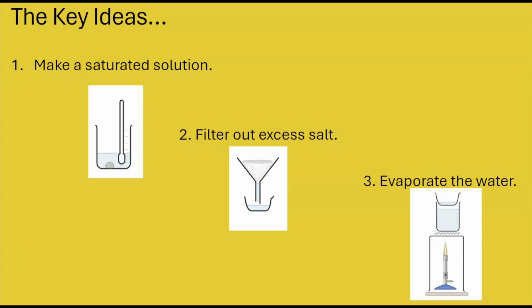And then your last step really is evaporating that water, and usually we will do that using an indirect method, just to avoid the crystals spitting too much, to avoid them thermally decomposing, and also to avoid any loss. So loss if the crystals are spitting out of the container.